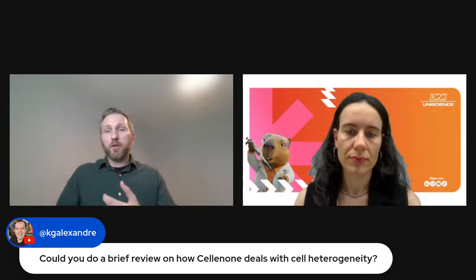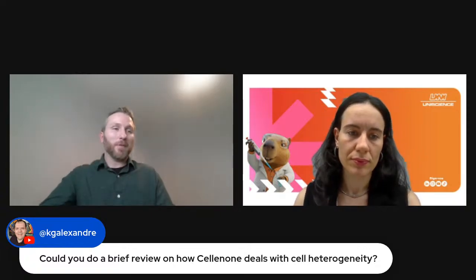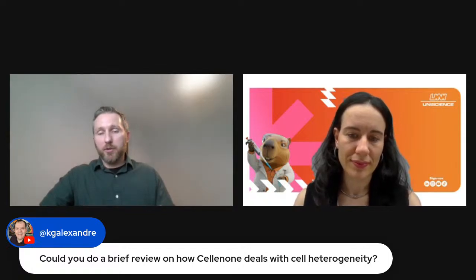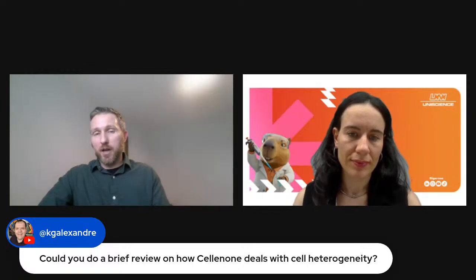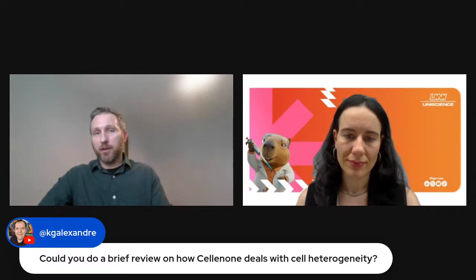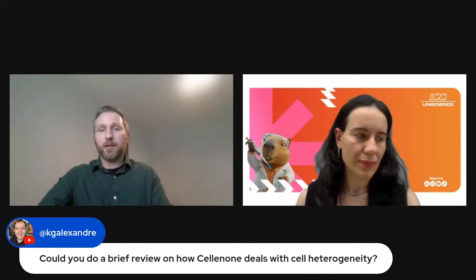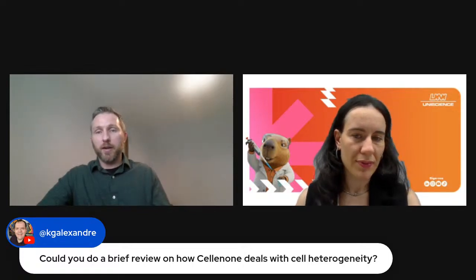Or, I'm sorry, heterogeneity, I'm going the opposite direction. If you want heterogeneity, then you can set very wide parameters, and you can make it so that it will isolate regardless of size or within a much wider range, but it will still document exactly what the parameters that are measured for each of the different cells isolated are. And it will also document where each of those go so that you can correlate exactly the metrics of one cell to where it ended up and then further down the line to your results.